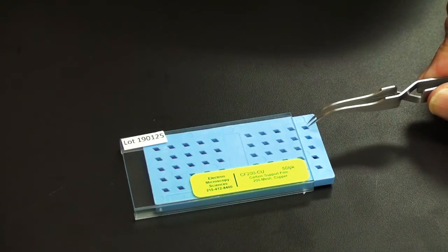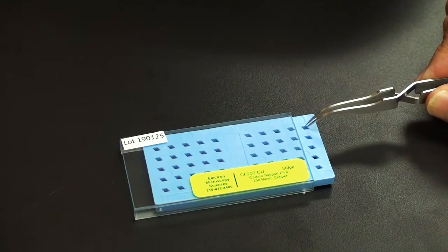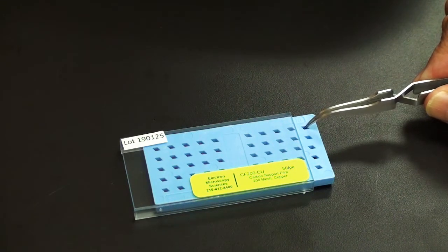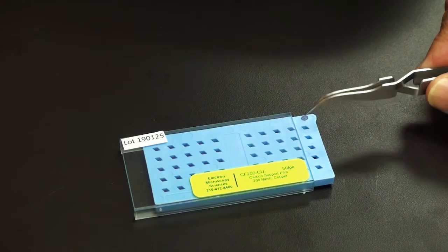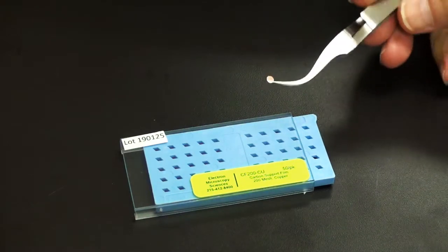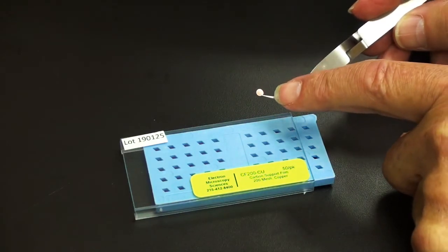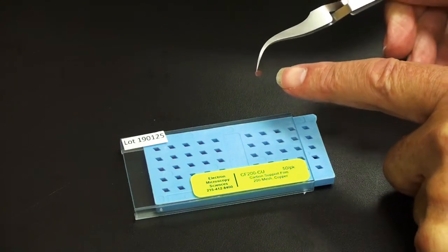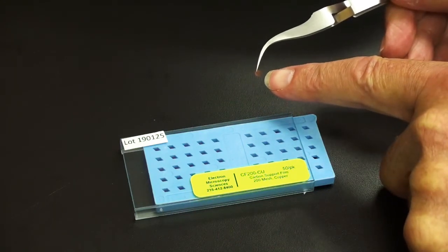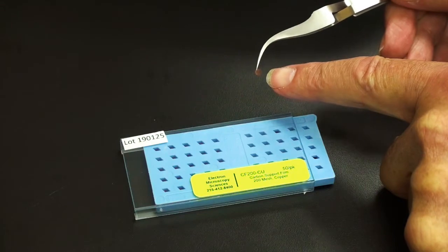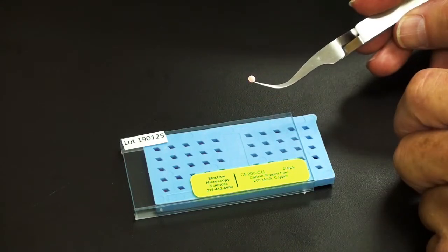First thing to do is to determine which side the substrate is on. Our substrates are all on the shiny or brassy side, and then there's the coppery side, which is that one. The brass side is a little shinier and darker. So all of ours are on the brassy side, not the copper side.